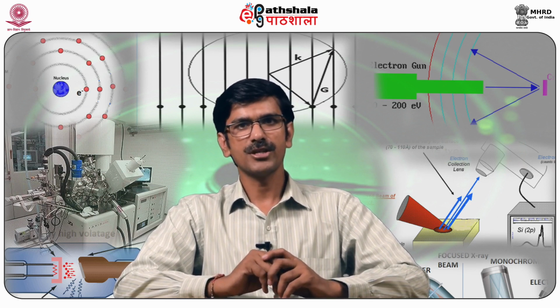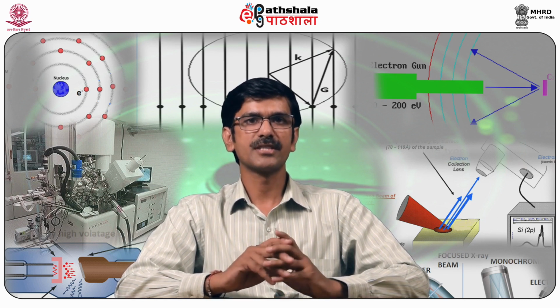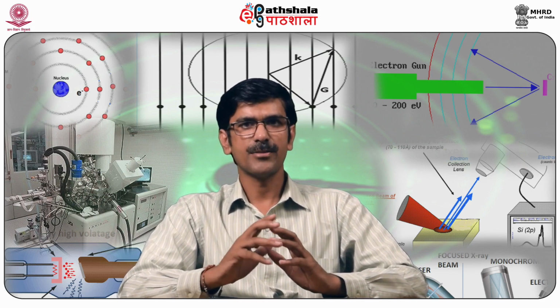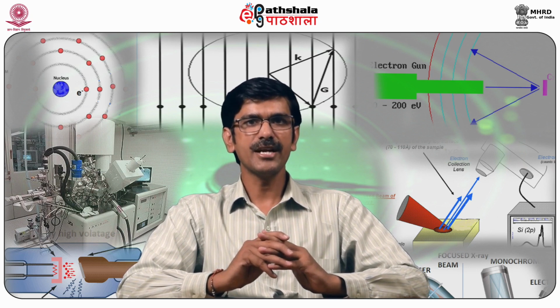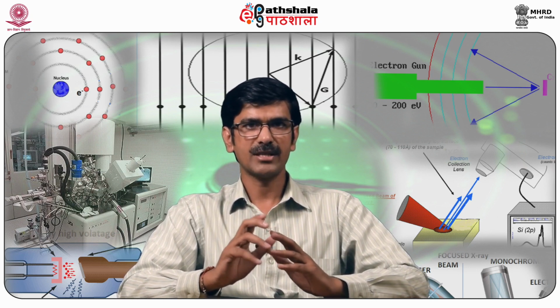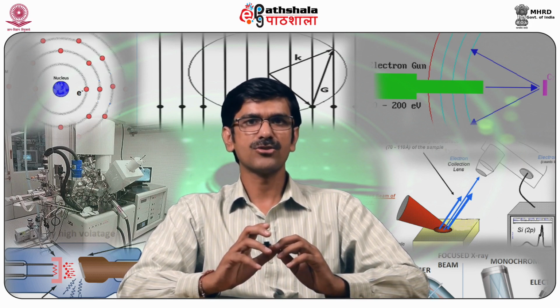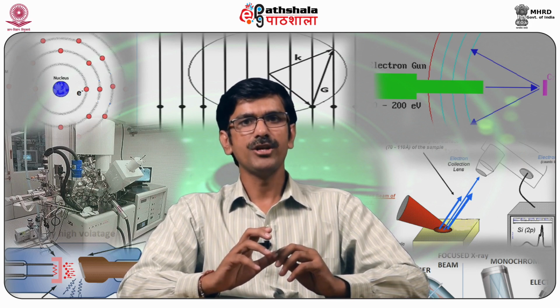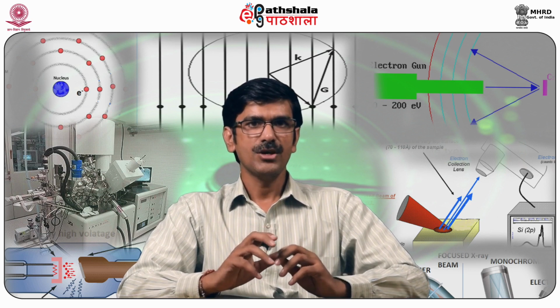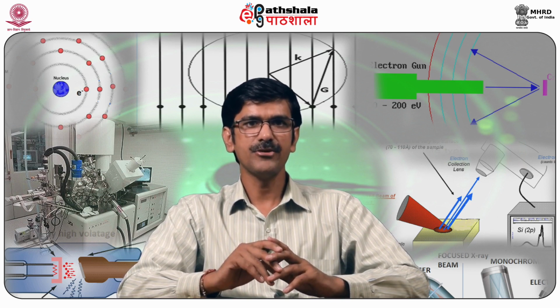Change in the rotational, vibrational or electronic energy of a molecule can cause Raman scattering. If the scattering is elastic, the process is known as Rayleigh scattering. If the sample being studied is irradiated by monochromatic light, for example from a laser, the recorded spectrum of scattered light consists of a strong line of the same frequency as the incident light with weaker lines on either side, shifted from the strong line by frequencies ranging from a few to about 3500 cm inverse.